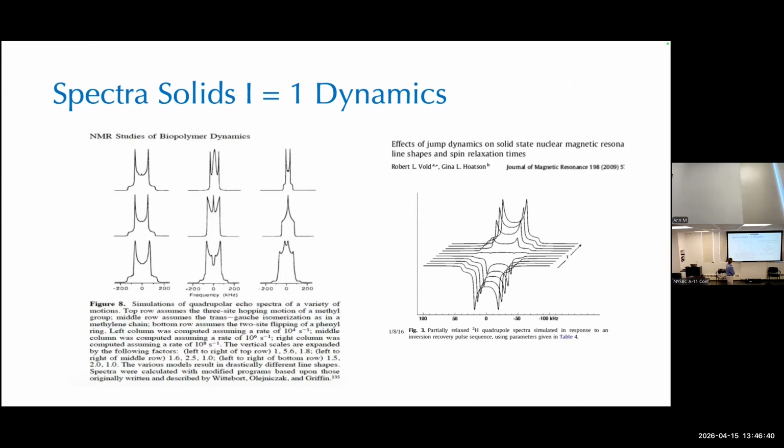There's just a lot you can see, and that has been utilized in biopolymer NMR. I would say the richest literature is for lipids and what they do in their phase transitions and composition, what kinds of motions down to the methyl group at the end of the chain, on the methylenes in the middle, up near the head group.